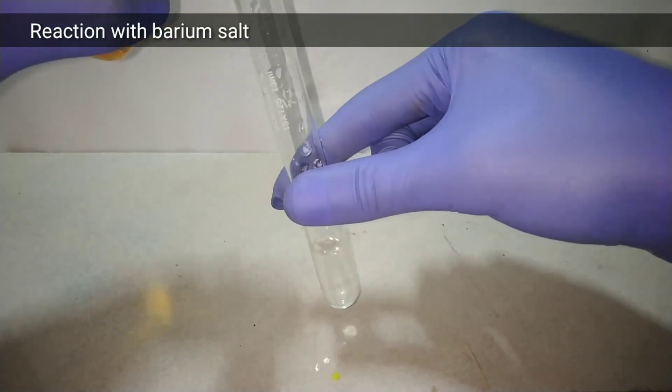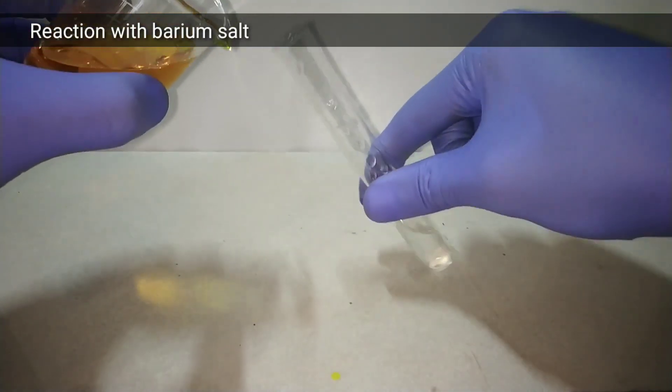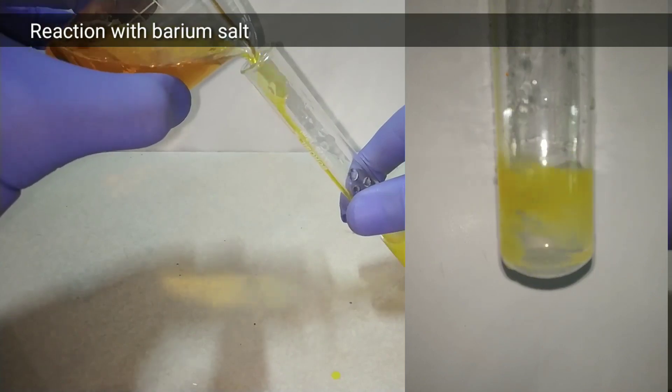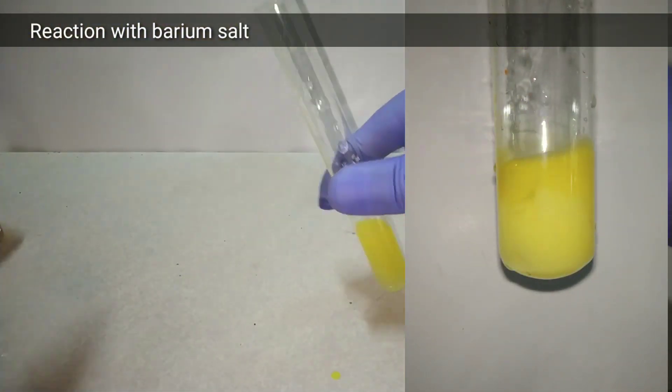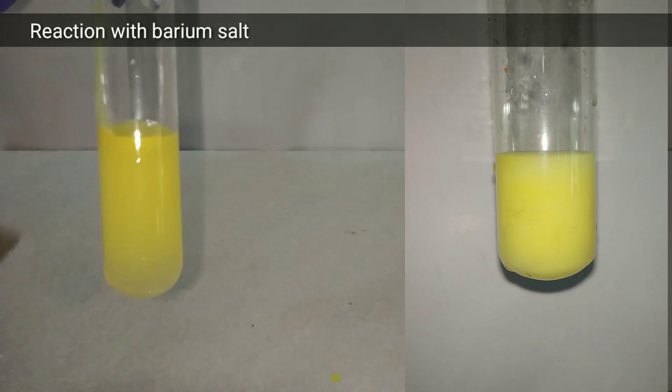A similar reaction occurs when we add ammonium dichromate into a barium salt. On adding the ammonium dichromate you can see a pale yellow colored precipitate of barium chromate is formed.